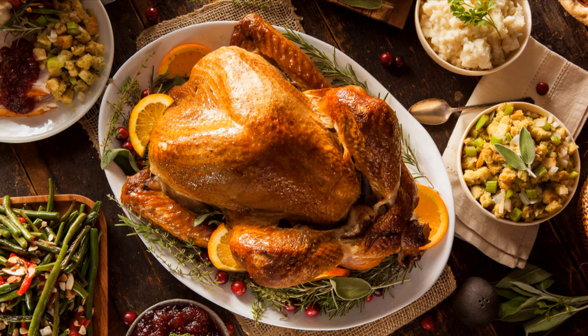So, a good meal typically includes a main dish, which usually contains some protein and is prepared according to chef's skills. The process is quite similar when it comes to the analytical determination of carbohydrates in protein-containing samples. We need skills in sample preparation to make the carbohydrates accessible for the analytical determination. So, what do we do?